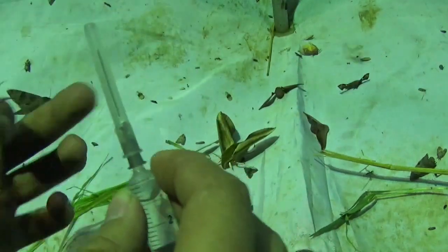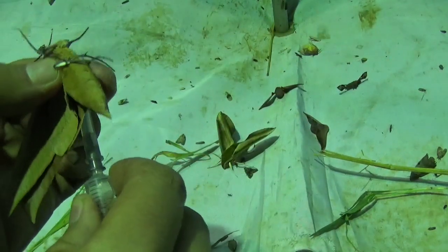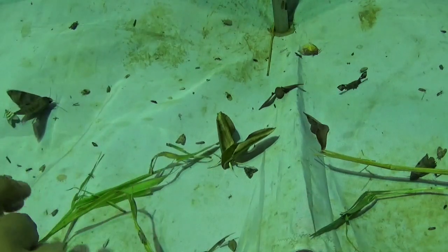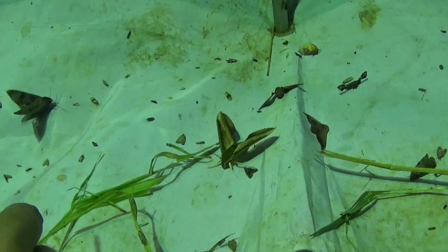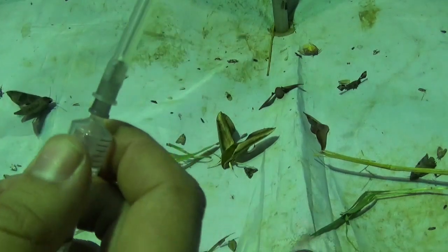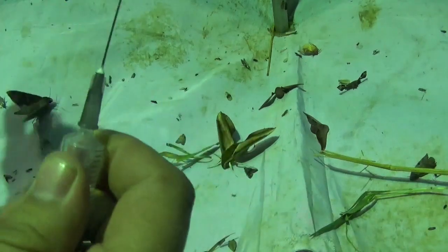This needle has a safety cap which should be on at all times. For the killing demonstration I am going to take it off.